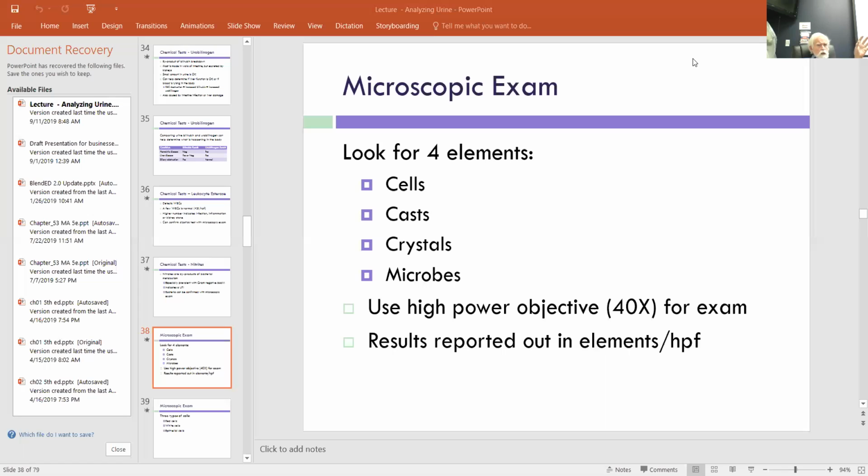Now, we can, under a microscope, see most bacteria, and we can readily see blood cells, because bacteria are about 1/10 the size of most blood cells. If we can see the bacteria, we can see the blood cells. Mm-hmm. So we will do that.